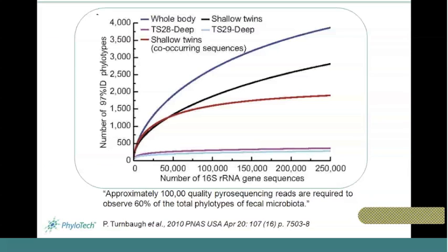of experimental design to consider is the depth or comprehensiveness of the microbial data to capture. This will depend on the question you're attempting to address and the diversity and the range of the richness of the microbial populations in your specimen. Sequencing-based methods require that you go surprisingly deep to capture a complete view of the microbiome. For instance, 10,000 to 100,000 reads typically won't capture moderate to low biomass numbers in a bacterial community.